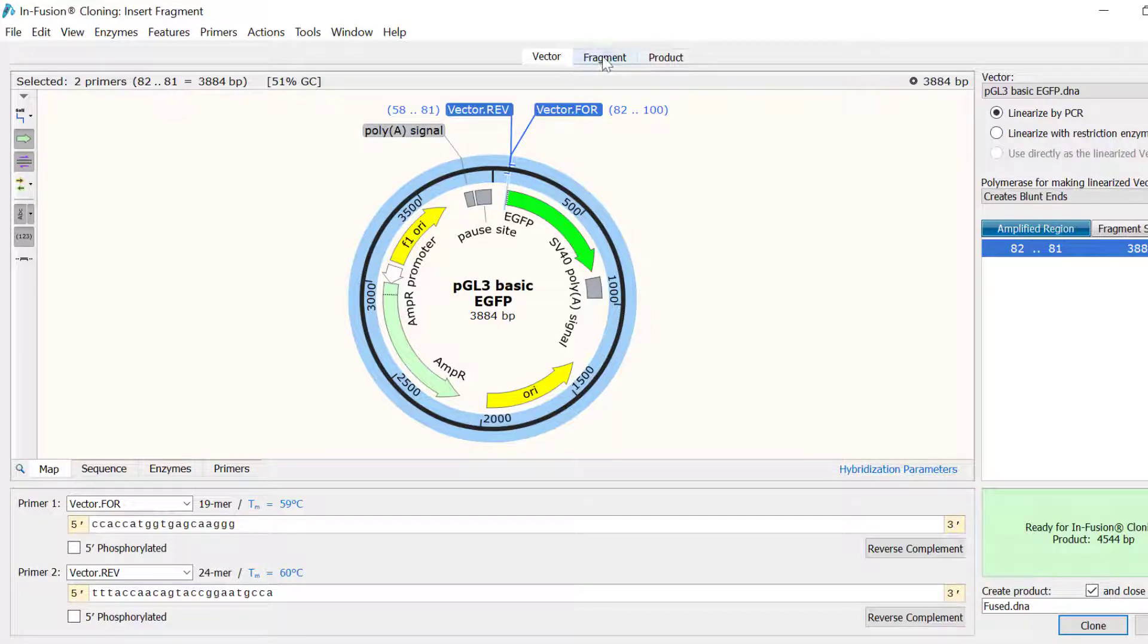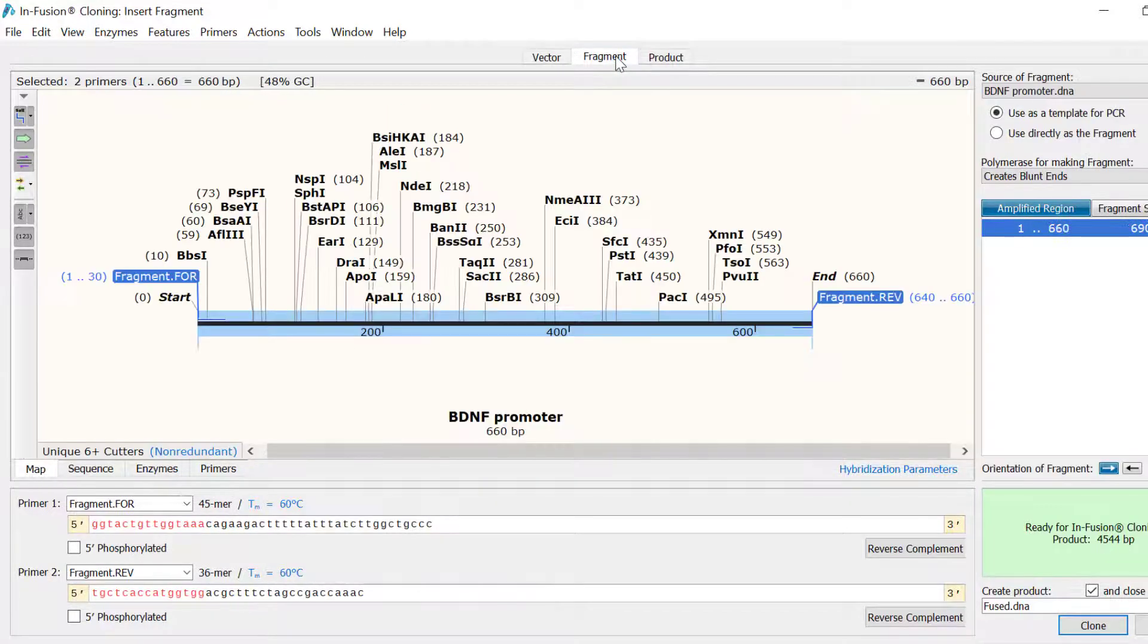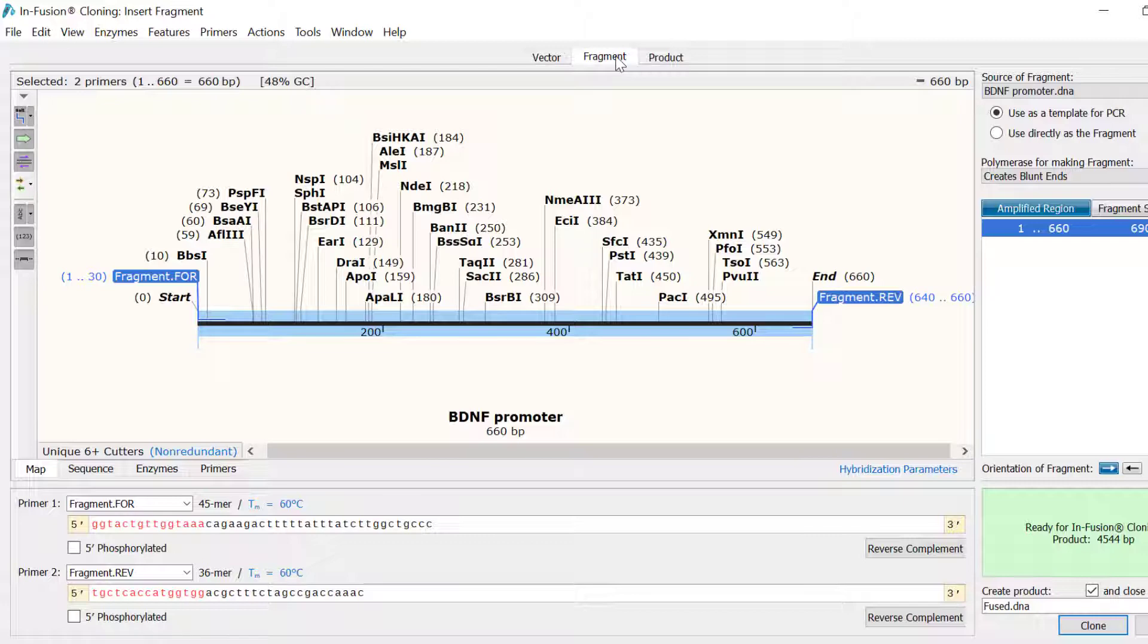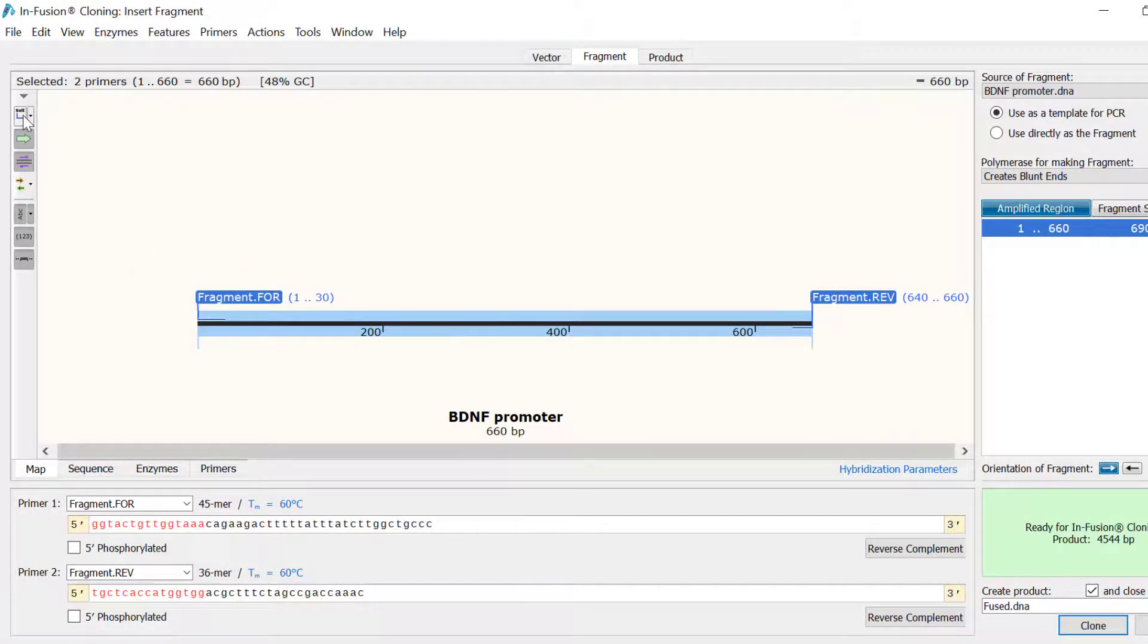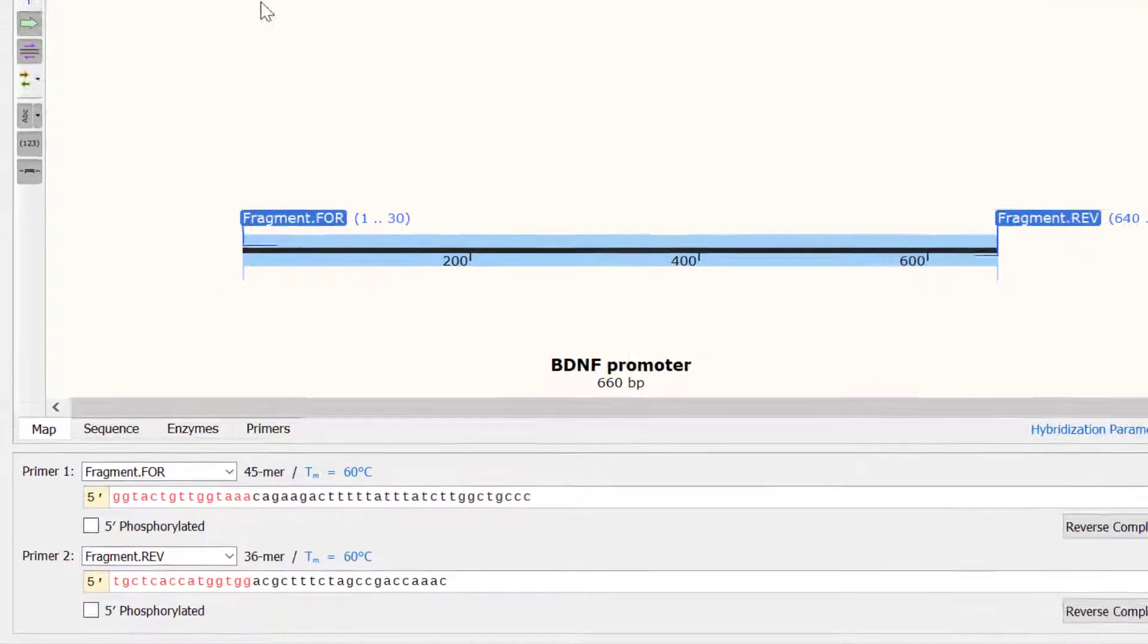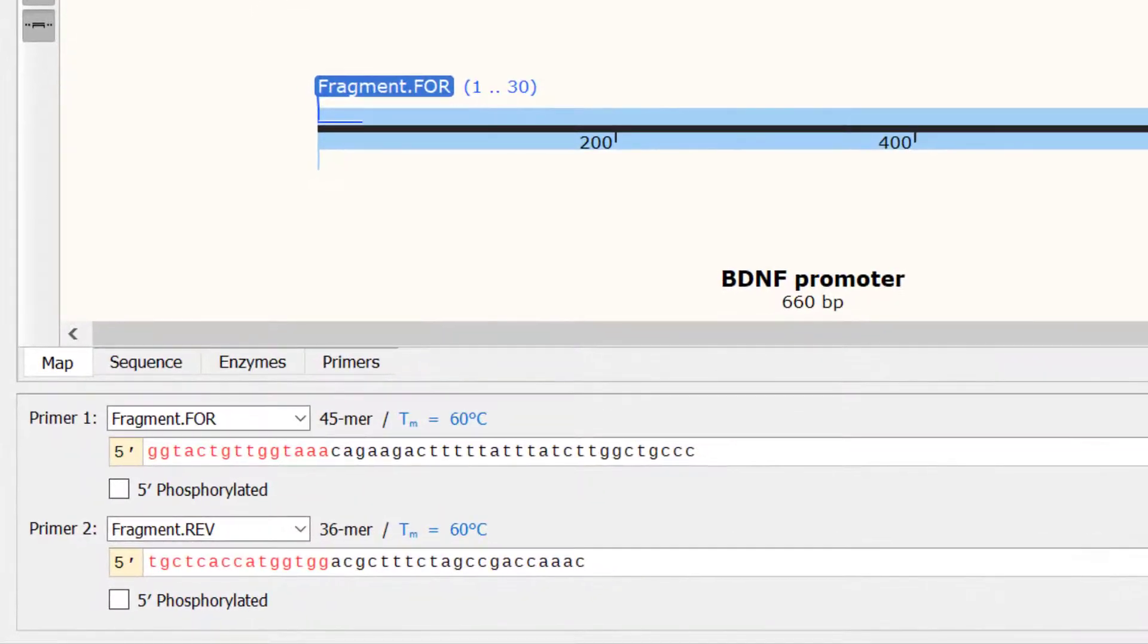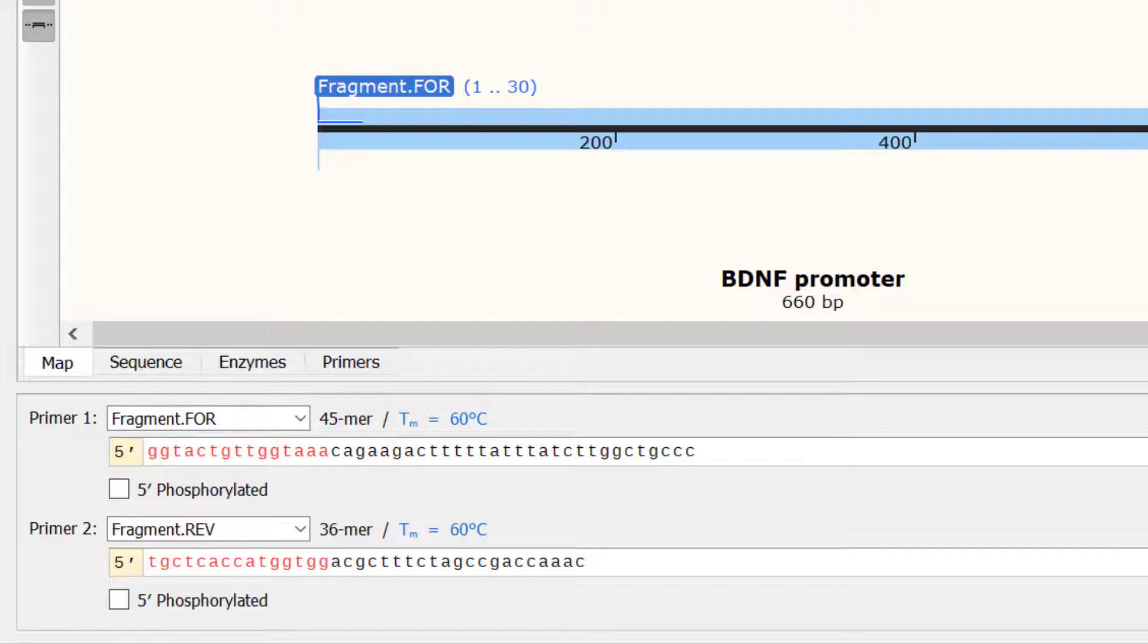In the fragment tab, you can see that there are another two primers, this time named fragment.FOR and fragment.rev that flank my insert. In the primer sequences displayed below, the bases shown in red are the overlapping homologous sections that match that at the insertion point in the vector.